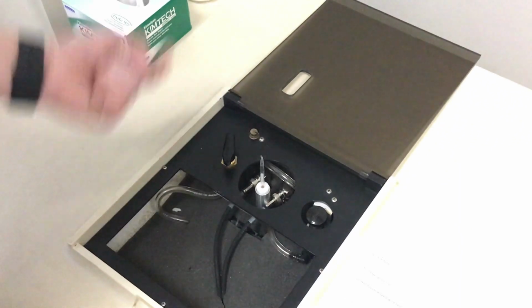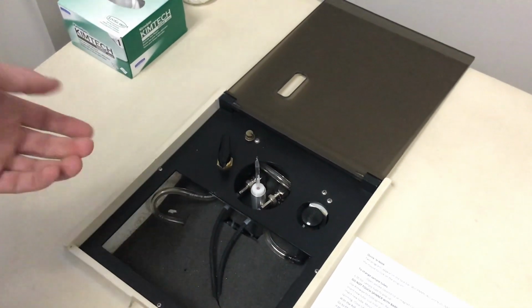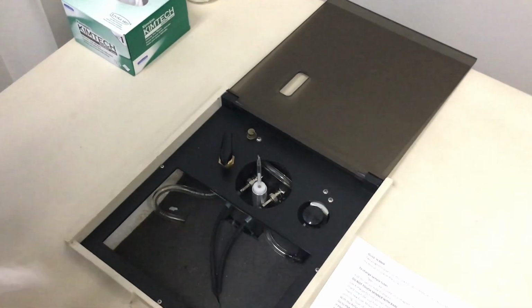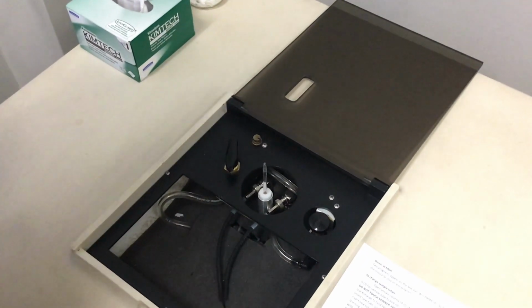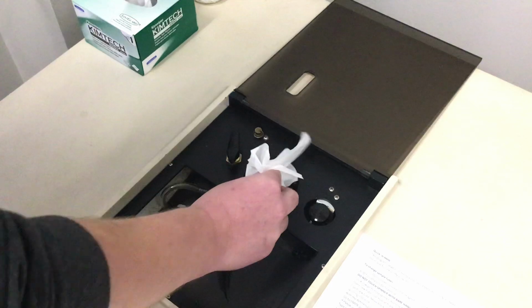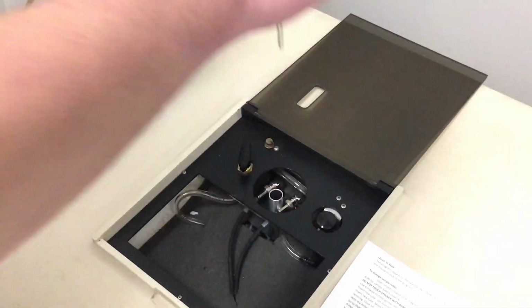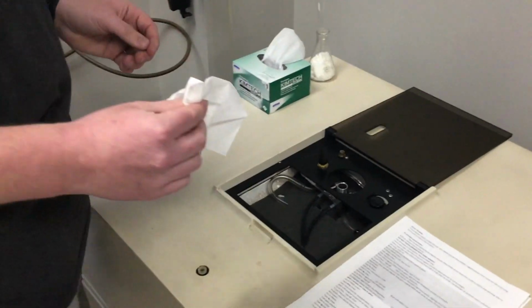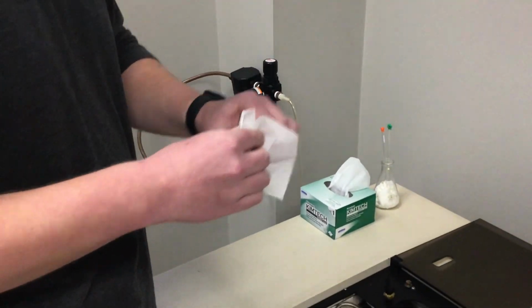If you do it really fast, it'll shoot out of the top. I don't think it will go that far, but it's better to just do it the slow way to make sure nothing happens here. Now, this is spinning pretty fast. It won't burn your fingers if you grab it, but take a chem wipe and go ahead and pull the spindle out. Sometimes I just like to turn the air pressure down a little bit because it's kind of bothersome. But this is what it looks like.